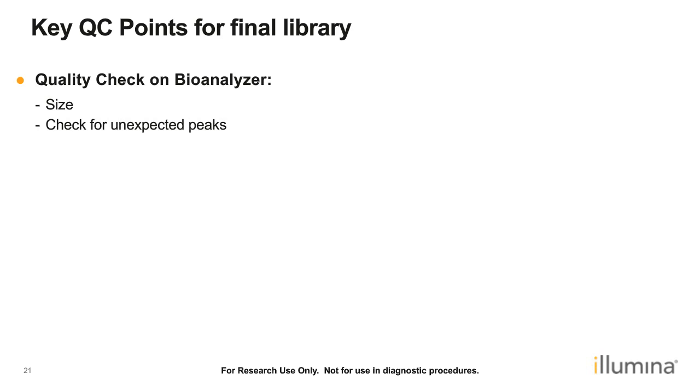Some key QC points for final libraries. Once we finish the prep itself, we'll want to check it on a bioanalyzer. We want to make sure that the size is in the appropriate range that we've targeted. We also want to look for any unexpected peaks.